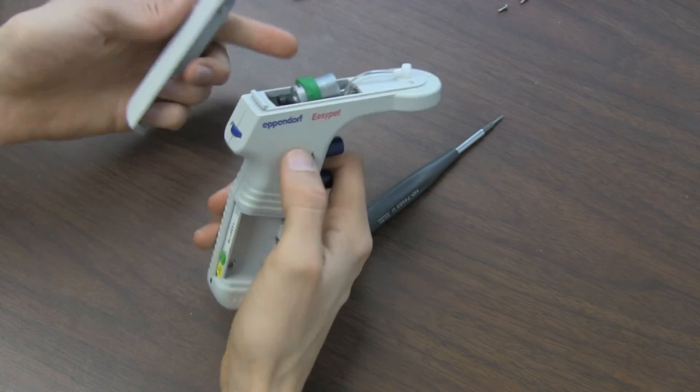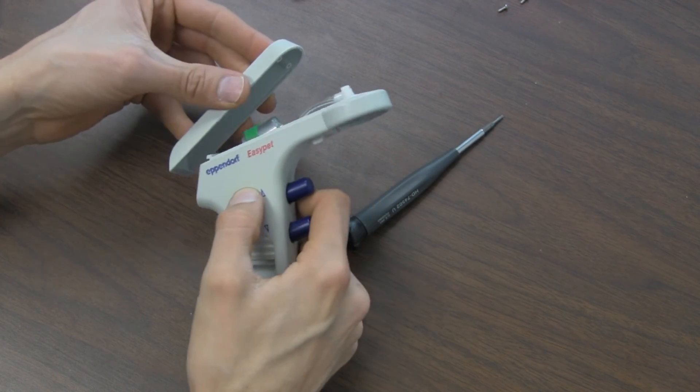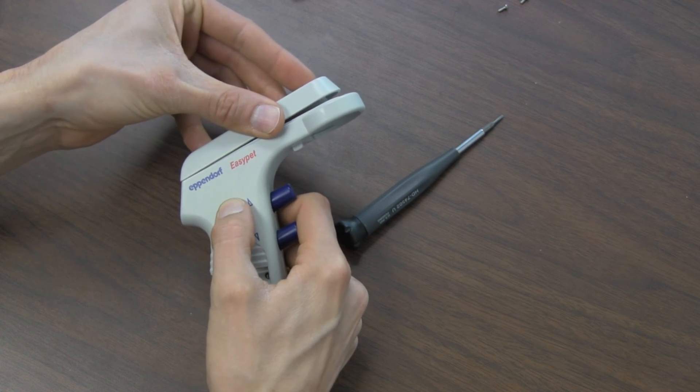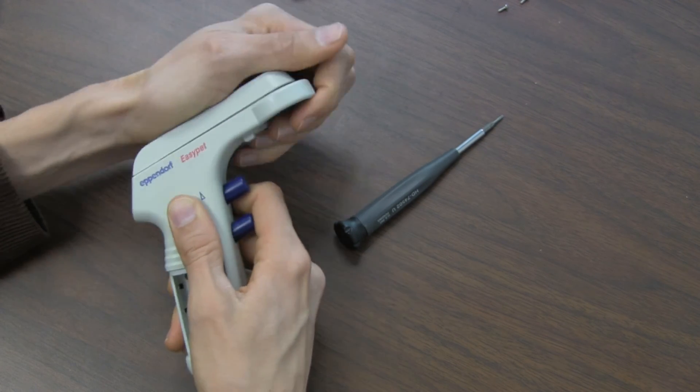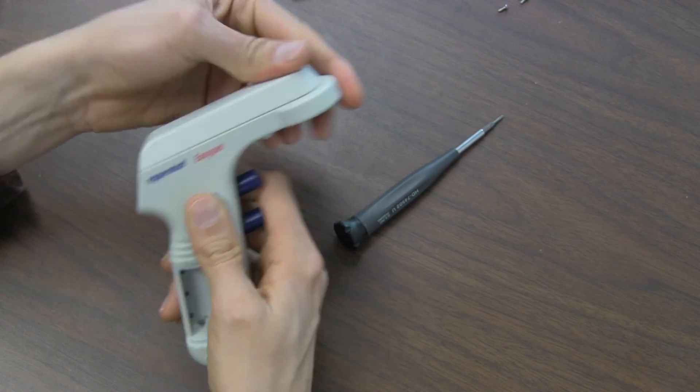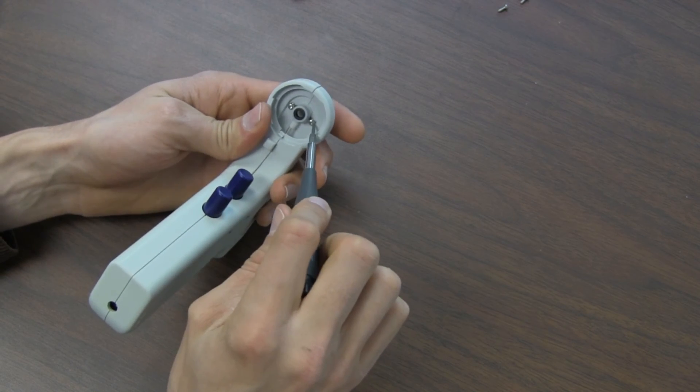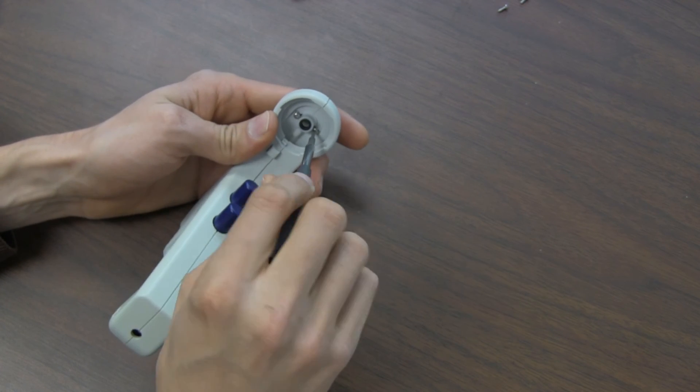Then you're going to take this top that you removed earlier, slide the back on first and push the front down. Make sure it's well seated. These screws stayed in place here so it's pretty easy to put them back in.